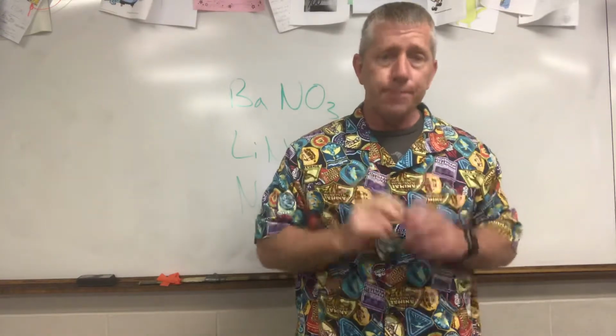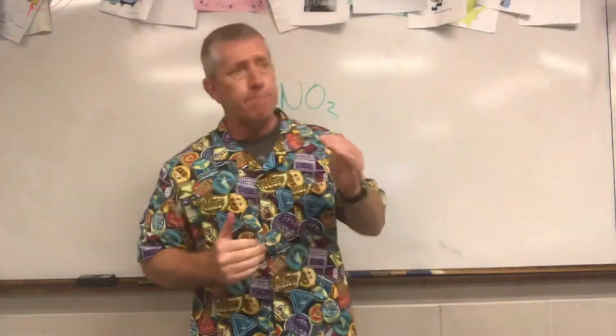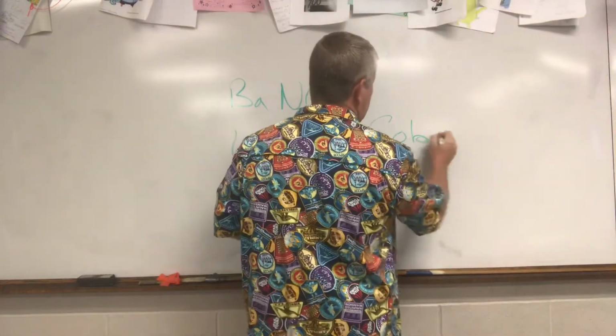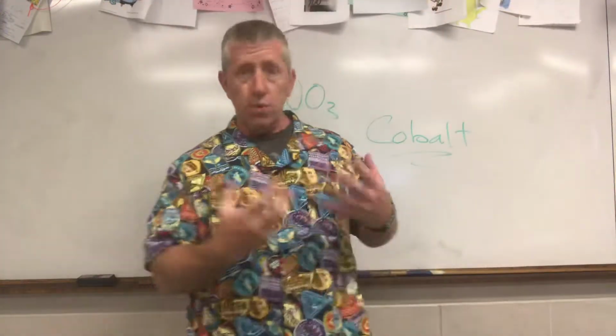The other thing you have to do is look up, down below in that data table, it'll say sodium with cobalt glass, C-O-B-A-L-T, cobalt glass. That's blue glass. It's stained glass. Cobalt has a distinctive blue color to it.